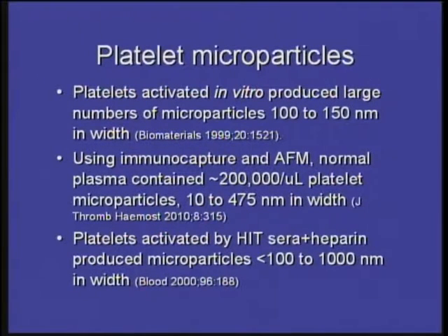A couple of the interesting ones, there was a study using atomic force microscopy where they took platelets and they activated them and they kept essentially taking pictures of them. And what they saw were that platelets activated in vitro produced large numbers of microparticles that were about 100 to 150 nanometers on average in width. So they were pretty small.